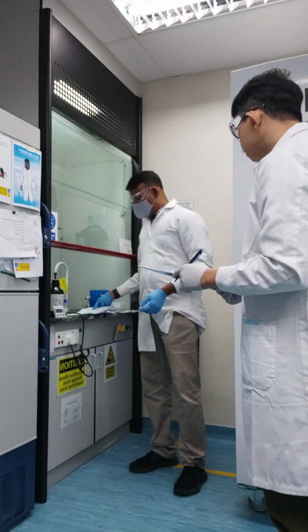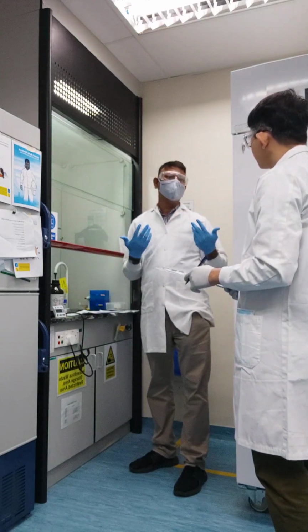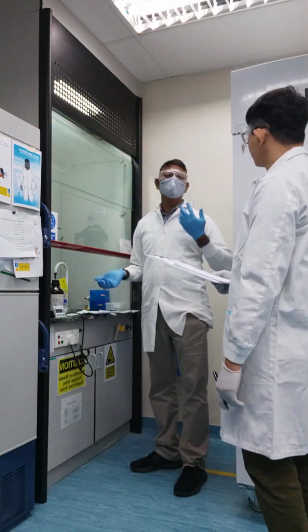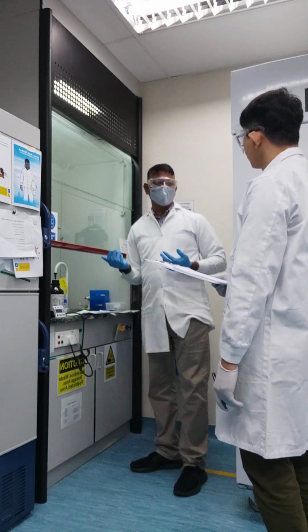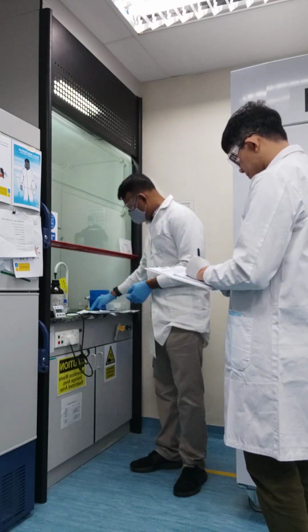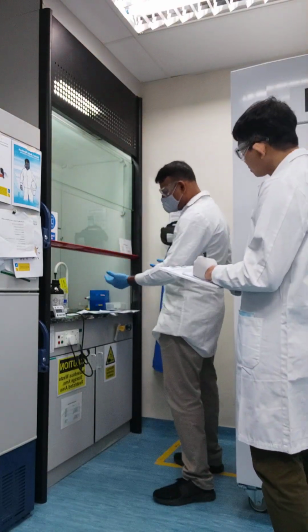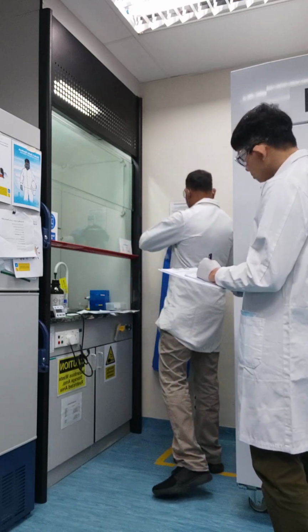Okay? So now I'm going to go to steps number 4 and 5. Okay? So after you have read all this information and understood it, the next step is to use the correct PPE, because you need to start to conduct your testing. So the fourth step is, based on the safety data sheet, you start wearing your personal protective equipment. So in this case, it is a corrosive substance. So we start protecting ourselves by wearing the appropriate PPE.